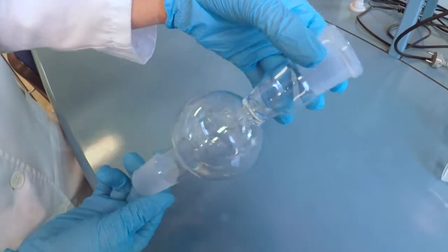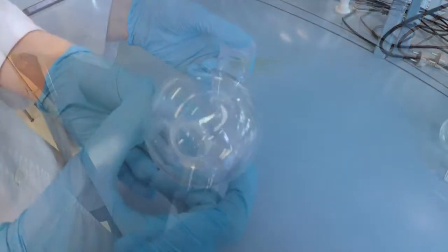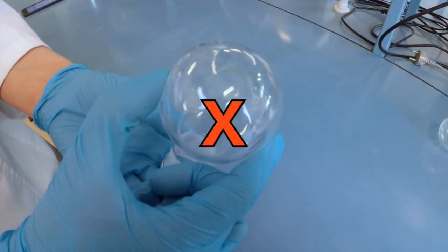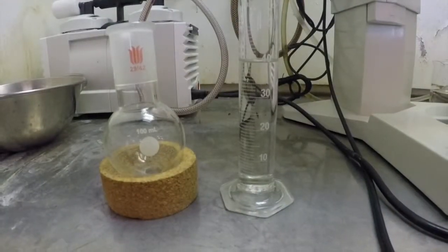All glassware should be checked for damage or cracks, and using improper glassware carries the risk of explosion. This includes the collection flask, the trap, and the round bottom glass being used.